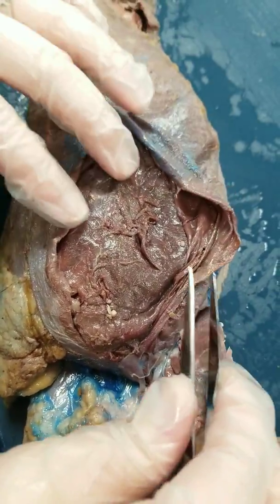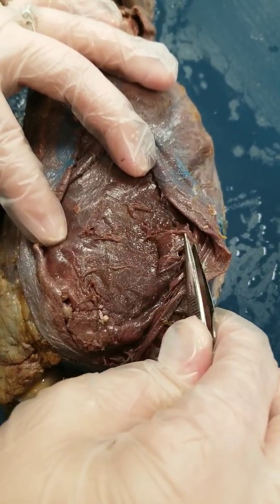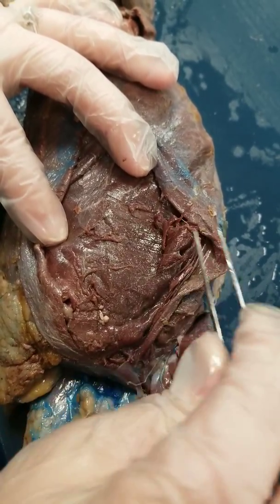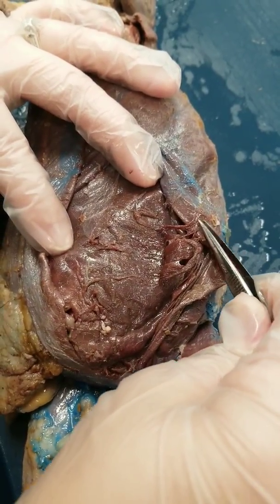You're going to lift this back, and the next one you'll see is your internal oblique, which is here. You can see that mine is shredded a little bit — I left it that way to show you that this is a really thin muscle, about paper thin.